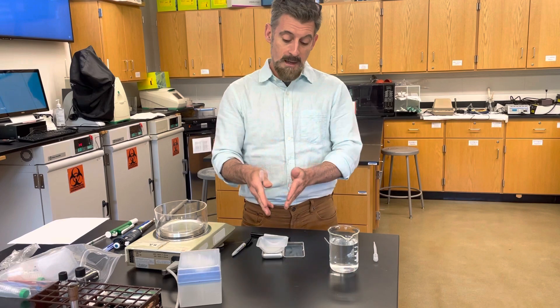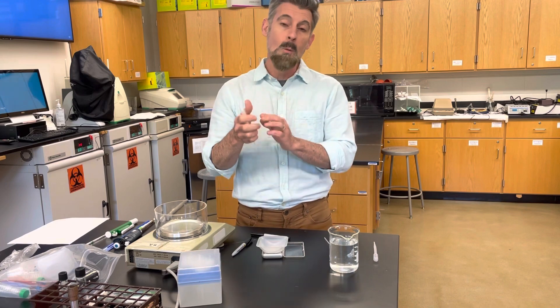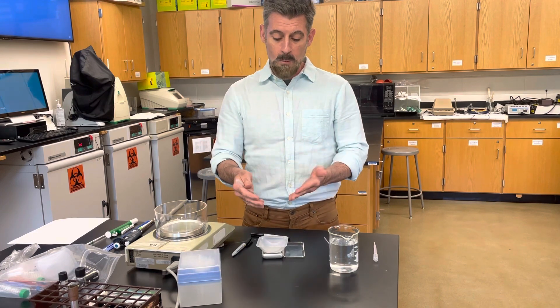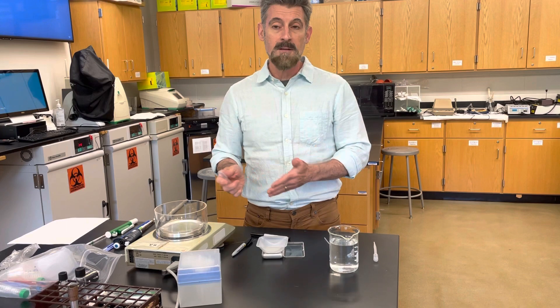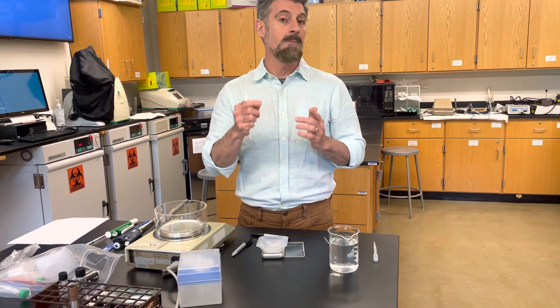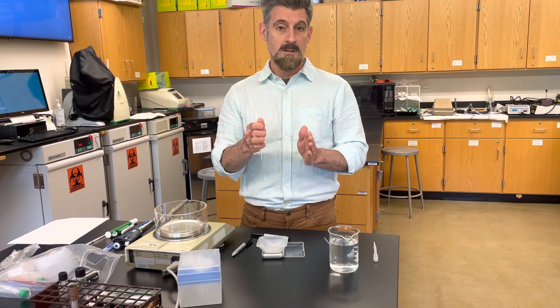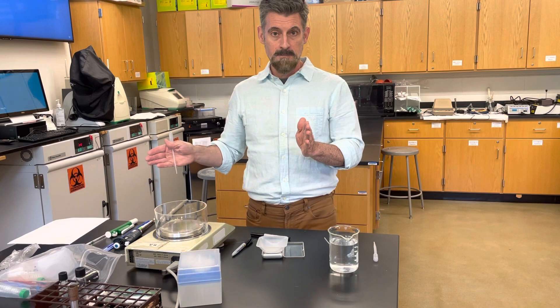Accuracy is how close your measurement is to what you expect. If I expect one milliliter and I weigh it and it says one milliliter, it's accurate. If it says 0.95, it's close but not accurate. However, if it says 0.95 every single time, that means it's repeatable — and that's what we call precision. Precision means it's exactly the same every time.